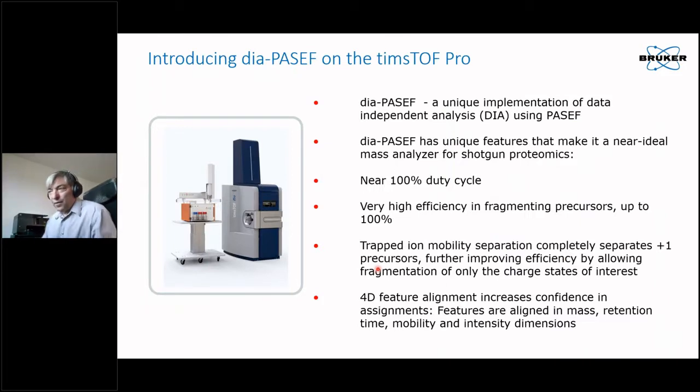The rest of the talk is going to focus on data that was acquired using a technique called dia-PASEF. So that's a flavor of PASEF that was developed as part of a collaboration between Matthias Mann and the group of Ruedi Aebersold and the group of Hannes Röst at the University of Toronto.